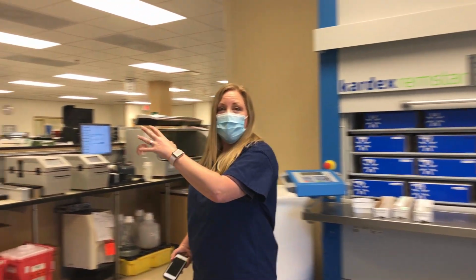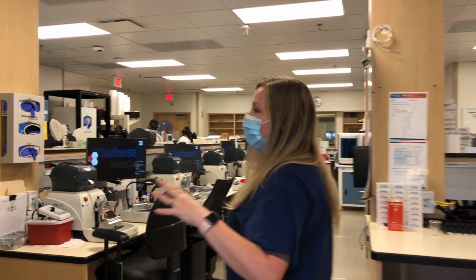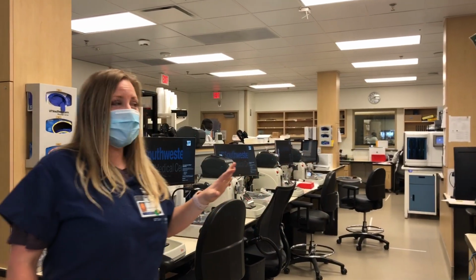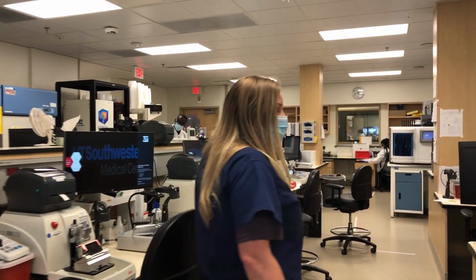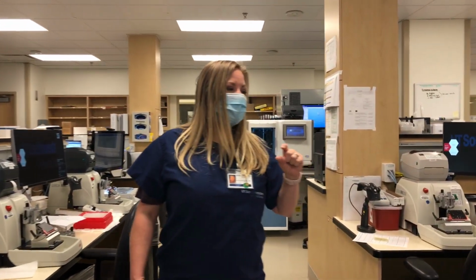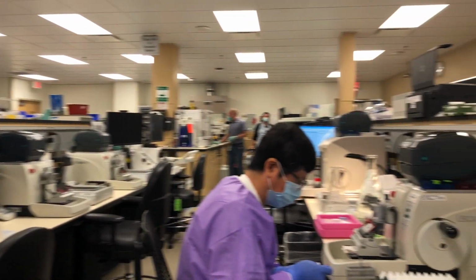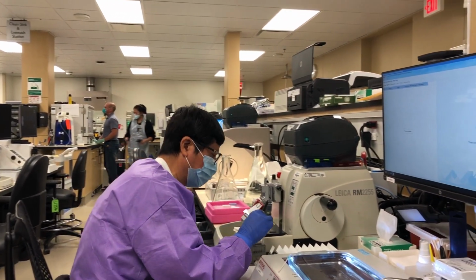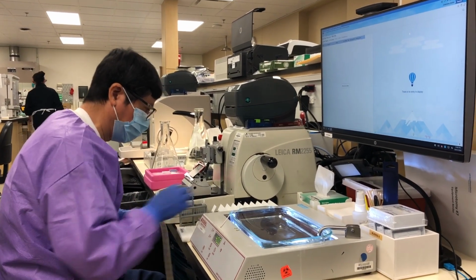On this side of the lab, we have all of our histology, our immunohistochemistry, and all of the other additional stages once a tissue has been processed and is going to be cut for slides. In our histology lab, that small piece of tissue is actually put into slides, which Justin is using on a microtome right now. He takes each piece, cuts it into 4 micron sections, labels those, and those are what will go out to be read for diagnosis.